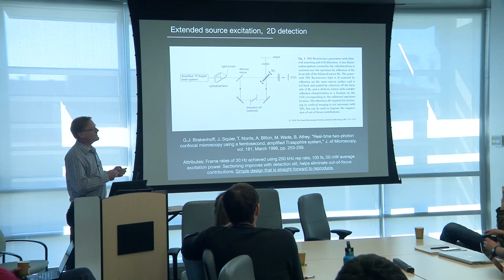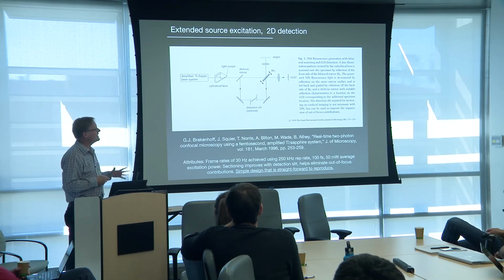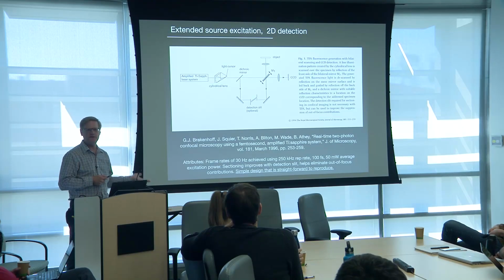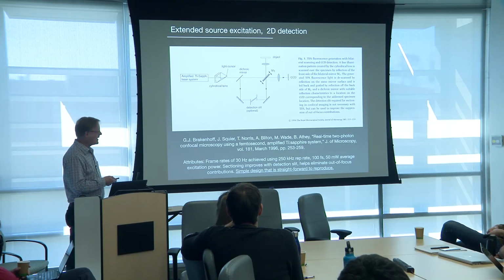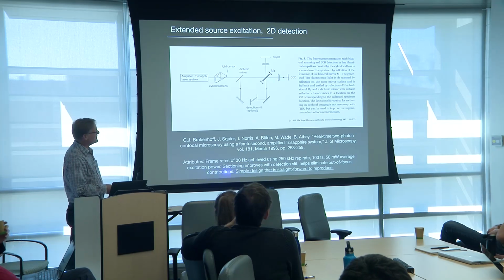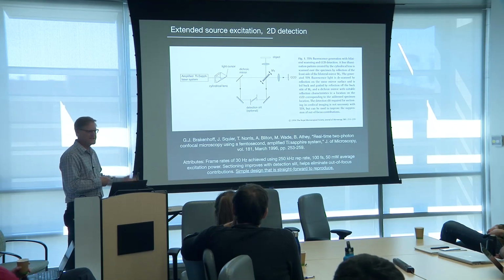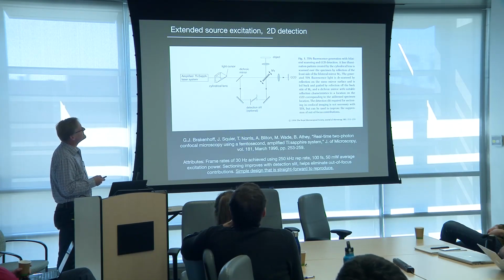So this little head is very small. It's, I don't know, about 8 by 8 inches or something like that, and you've got a video rate system up and running. So the challenge, though, is that it's a simple design, very elegant, straightforward to reproduce. If you wanted to build a second video rate system, this is something to consider.